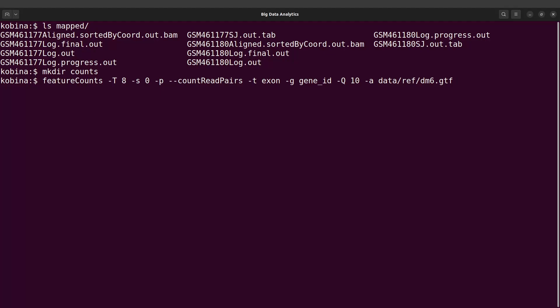We also need to specify the output. We say -o and specify where the output file should be stored. It's going to be in the counts directory — remember we created a directory called counts. So we say counts/ and give a file name.